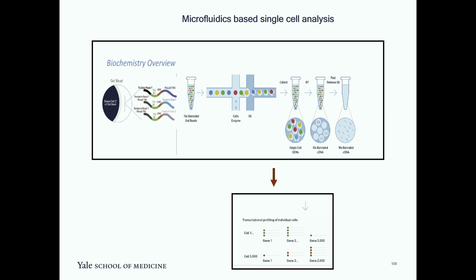So either of these conditions. One of the ways it is done is through controlling the cell number, and if you have a good suspension, the cells are a single cell suspension, and they are not sticky or anything like that. That is how it is done. The second thing, the whole innovation is in the pressure, the control of the pressure by the instrument, the Chromium system or anything. That is one of the other factors here.